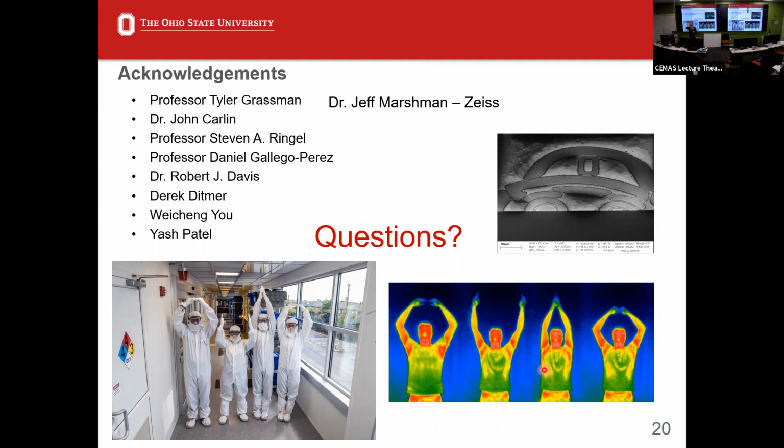So the one where we had the small, not super small, 8-micron squares, we were able to cleave it and tilt it, though not get a true cross section. But a lot of times we design a test pattern that actually has long lines, so you don't have to be really good at cleaving and hitting your spot, because it can be very challenging when you're trying to figure out what's going on with a process. You have a sample that's this big and you're trying to cleave it and you miss, and then you have to do it again and the sample gets smaller and smaller.